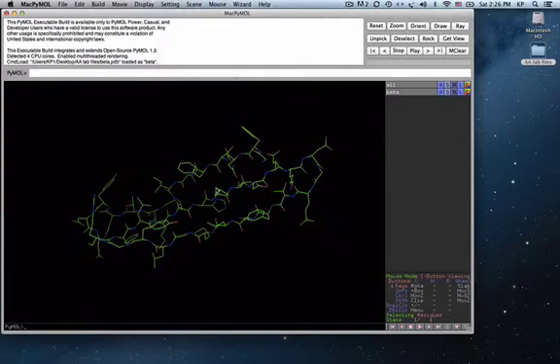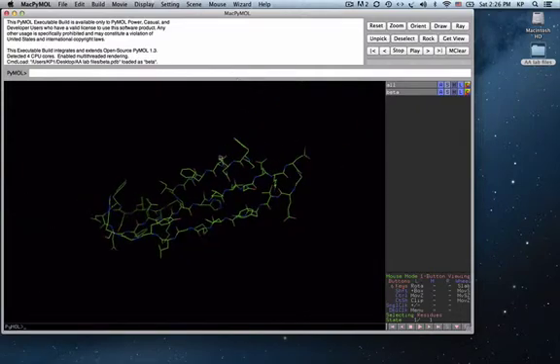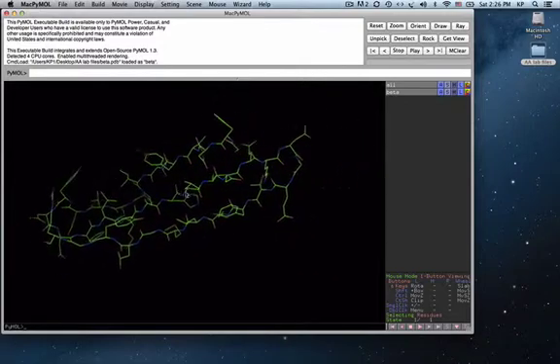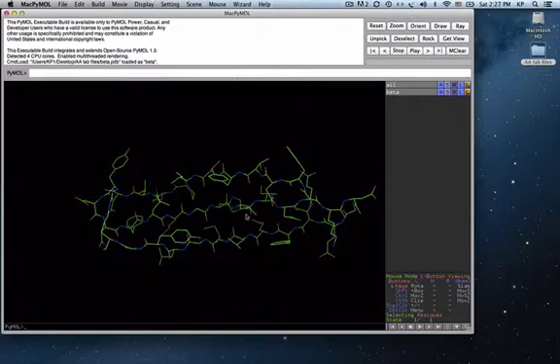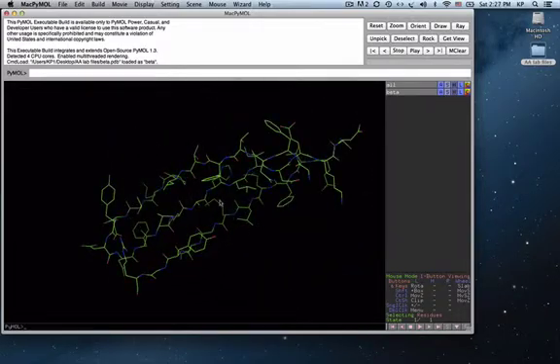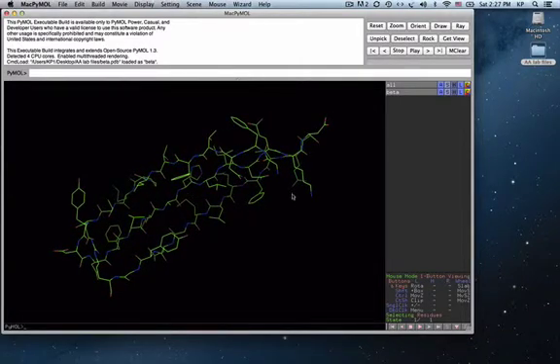I'm on a Mac, and right now I can press Control and move up and down on my trackpad, and I can zoom. Clicking Option as I do this allows me to recenter, and I can just turn this around in general by clicking on it. I'm going to recenter this just a little bit.